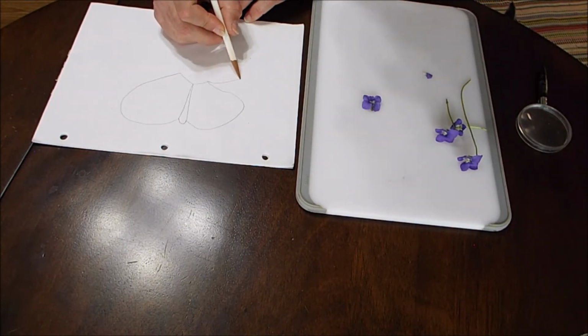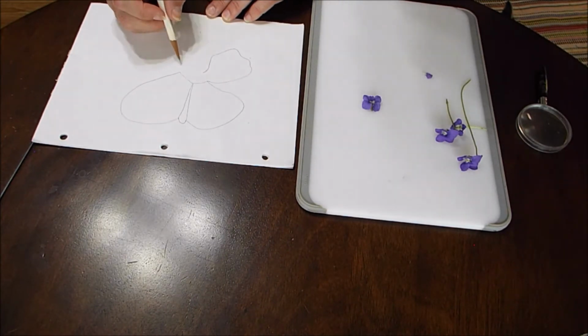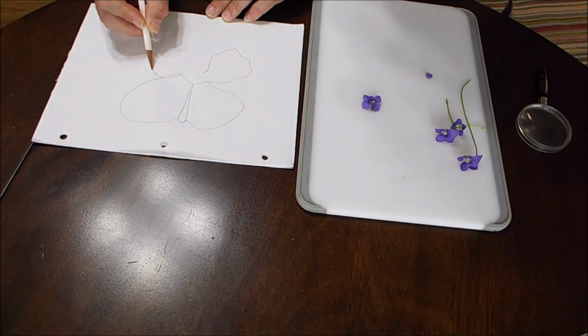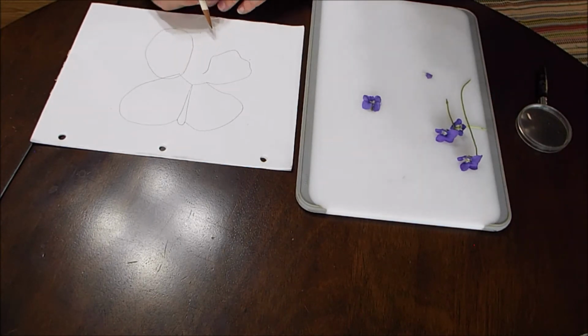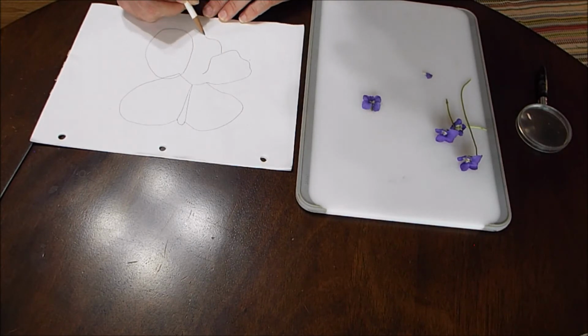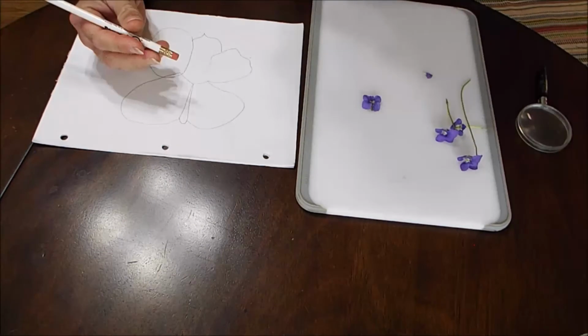Alright, now this one's going to come out, way out. Kind of has a dimple in it there, and back up. And then there's another one over here. Kind of does that. It goes around, sort of a point, curves up, and kind of runs straight up. Not the most symmetrical flower ever. And then we have the lower lip petal, which has kind of a point on it like that. Alright, and then what we see, I'm going to take that piece off right there for clarity.